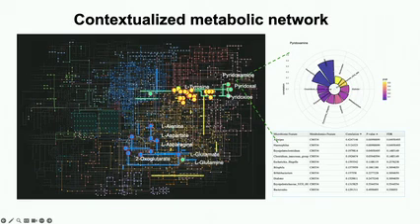Now all your current metabolites are overlaid on this customized network, and you can see the compounds and reactions and highlight these significant correlations. You can click on it and see which compound, which microbes have the capacity to generate compounds. And this capacity we can predict using a GEM model.